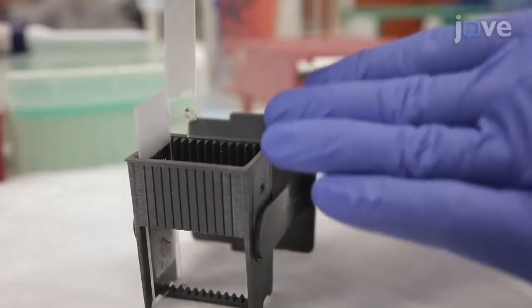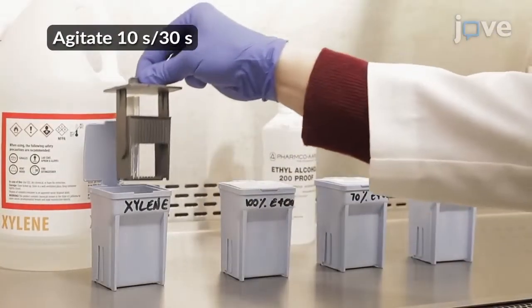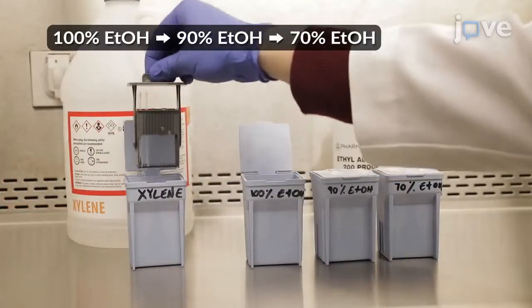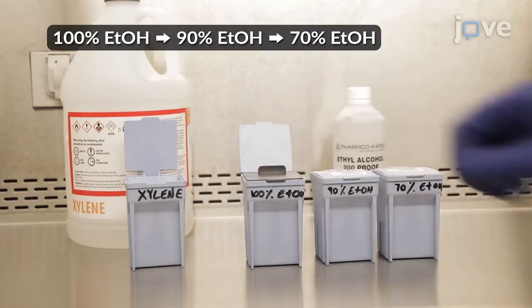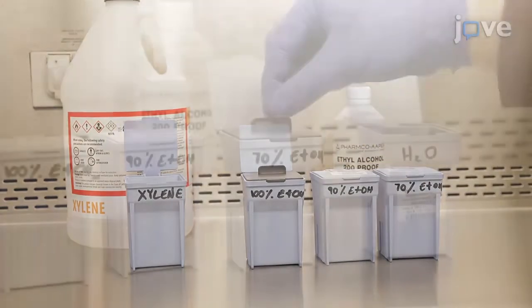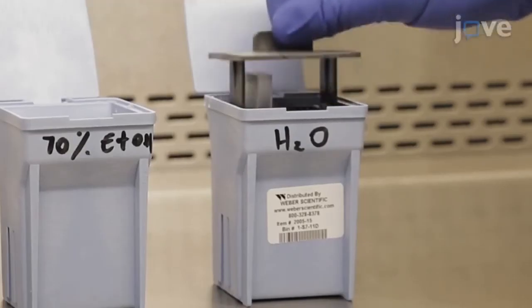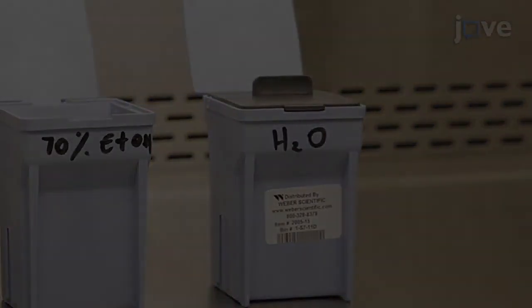Next, load slides into a slide rack and hydrate the tissues with 2 5-minute 100% xylene immersions and a descending 5-minute per concentration ethanol immersion series with 10 seconds of agitation every 30 seconds. After the 70% ethanol immersion, rinse the slides 2 times in double distilled water for 5 minutes with 10 seconds of agitation every 30 seconds.